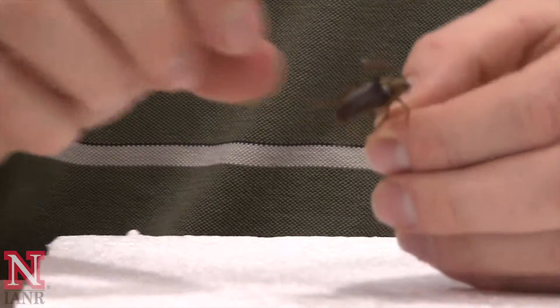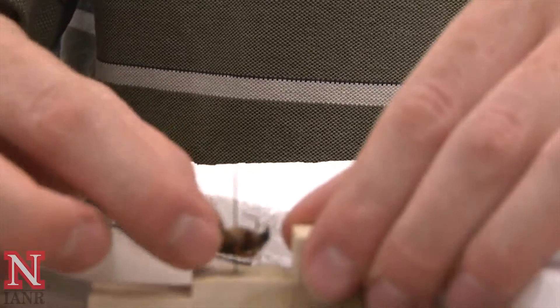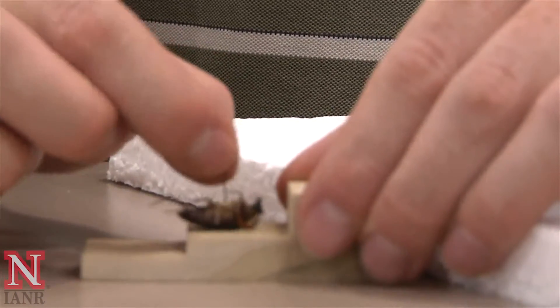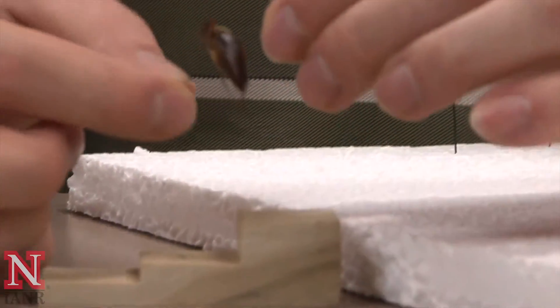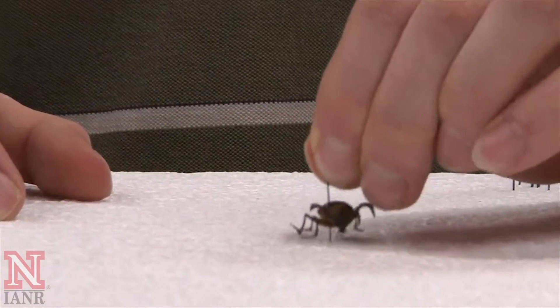Next, use your pinning block to make sure that your height on the pin is correct. For Nebraska 4H, we look for three-eighths of an inch to one-half inch.